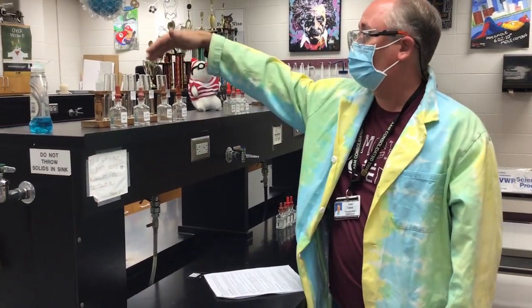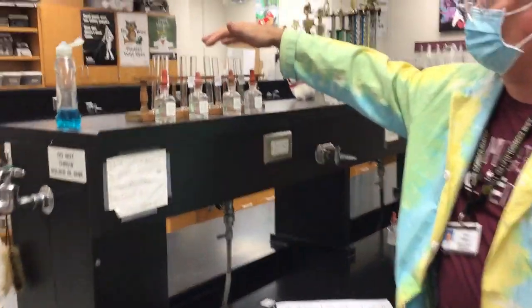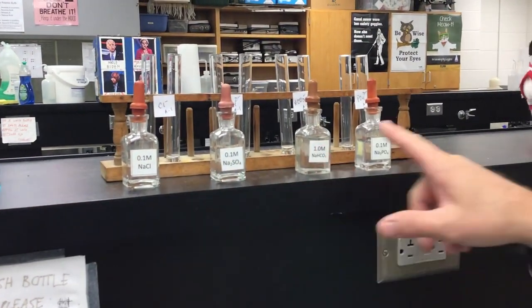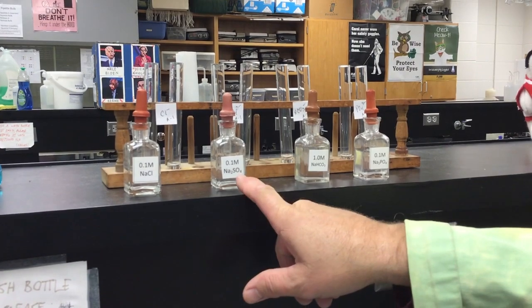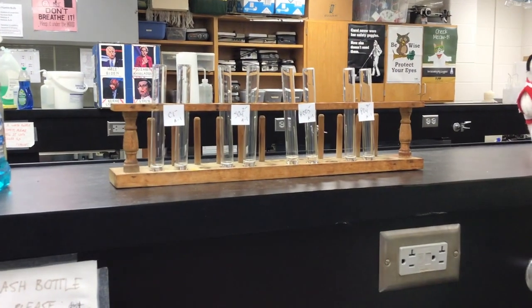We've got two test tubes for each one of these tests. The first one is for the presence of the chloride ion, the second one for the presence of the sulfate, then bicarbonate or HCO3 minus, and then phosphate. What I have in front here are each of the knowns. So this is sodium chloride, so that'll have chloride ions in it for sure. Then sodium sulfate, sodium bicarbonate, and sodium phosphate.